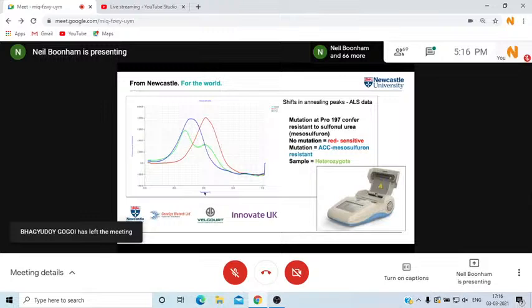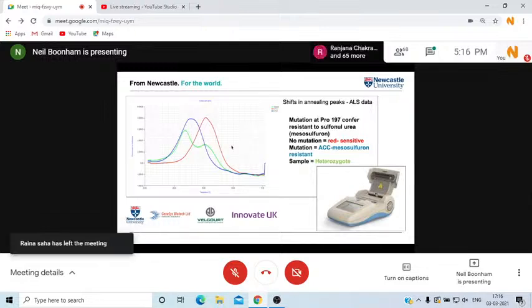Now, I mentioned the haplotyping that we did with a genie for black grass. We also did that for resistance in fungal pathogens in Septoria. And here's some data here, simplified data. Now, it does work. But as I mentioned earlier, this is great if you've got an individual. So for blackgrass, this works reasonably well. You can go and take a leaf from a blackgrass plant.